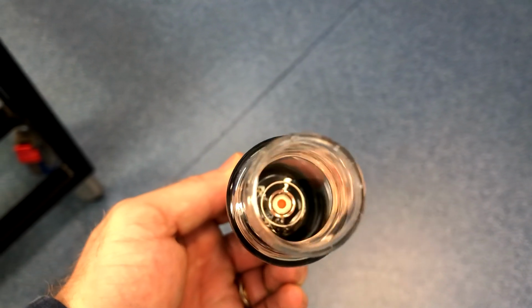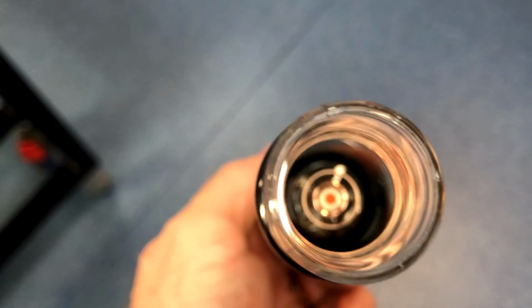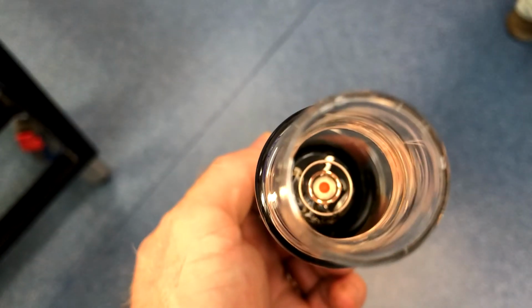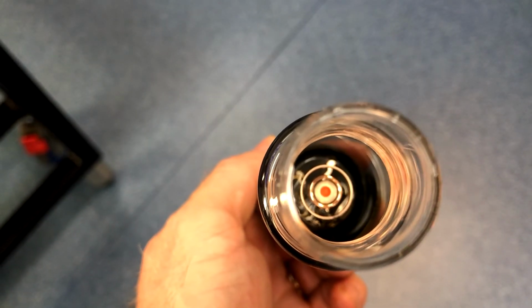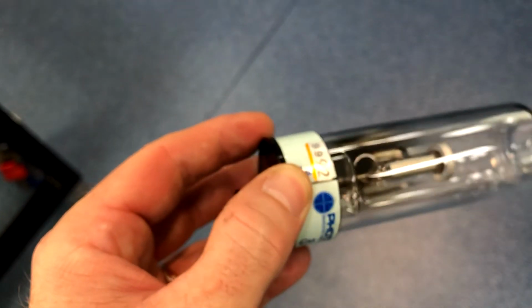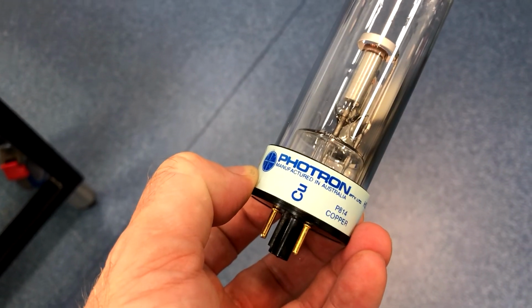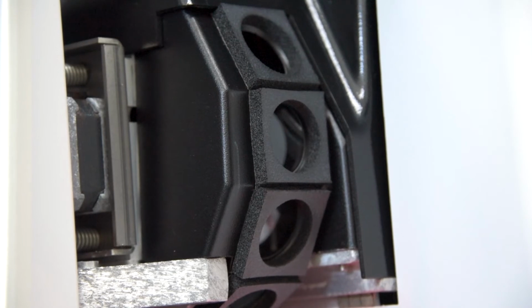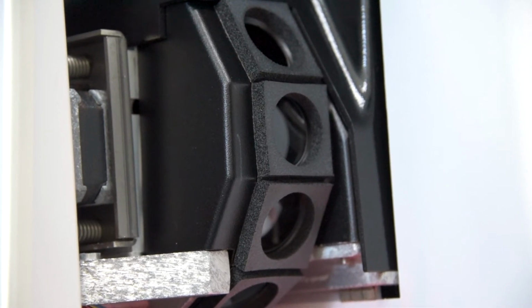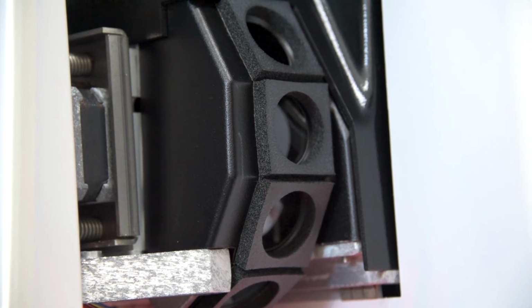This means that when it's energized, the lamp produces predominantly emission lines applicable to copper. To do this, the lamp has a low pressure of neon atoms inside of it. These neon atoms are ionized by the voltage applied to the lamp and collide with the cathode. This causes the atoms of copper to be sputtered into the vapor state, which allows them to be excited by the applied voltage. When the atoms fall to their ground state, they emit light unique to the element emitting them. This matches the wavelength of the source to the required wavelength for the analysis. Once produced, the light is steered around the instrument using mirrors.